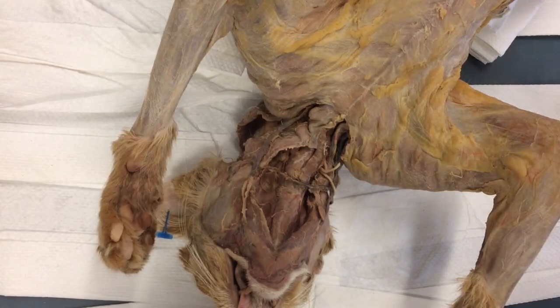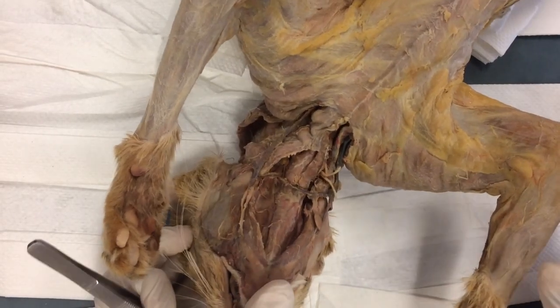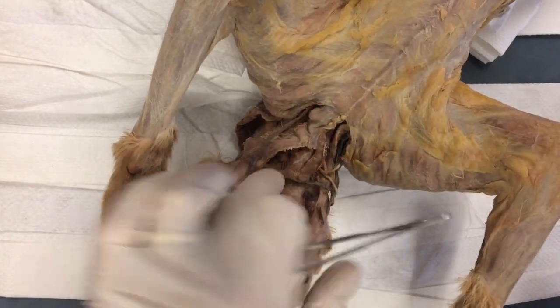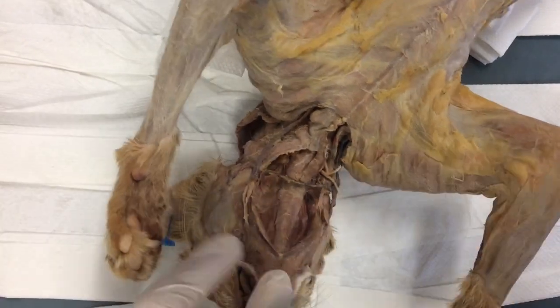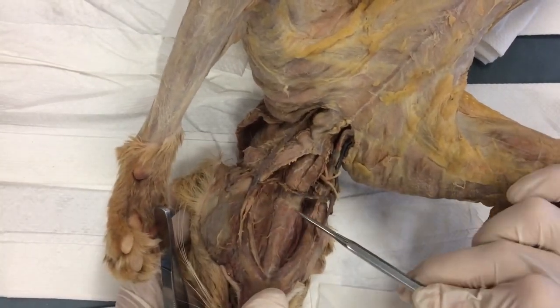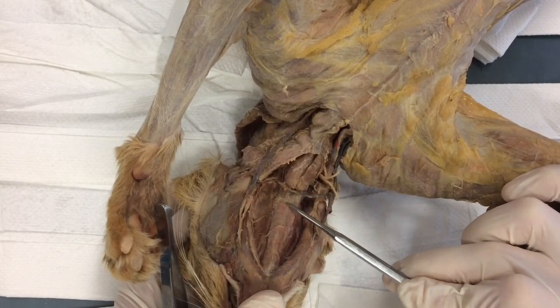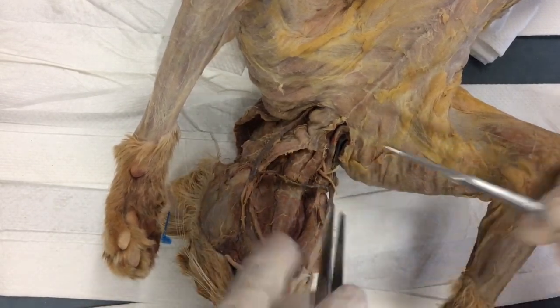All right, in this video we're going to do the dissection of the mylohyoid, and I have to be honest, this one's going to be tough. Now, if this is nice and clean, got everything done from the digastrics, you should be able to see mylohyoid ending right here. There's the end of the muscle fibers right there, and then there's some white, that's the tendon.